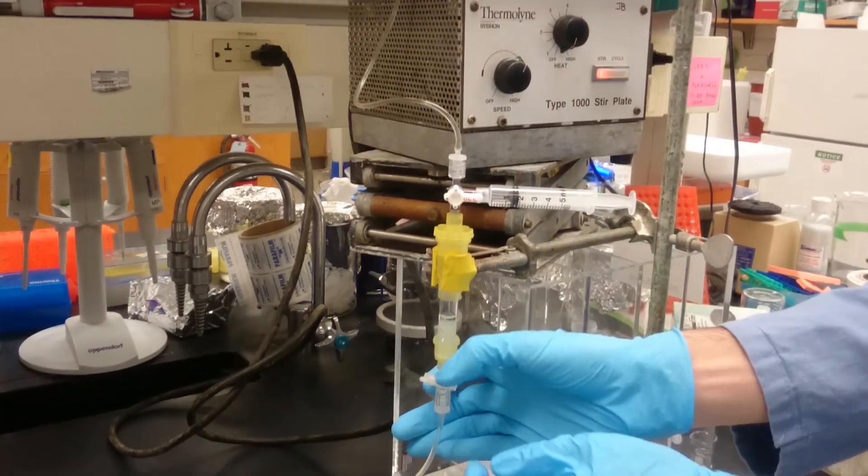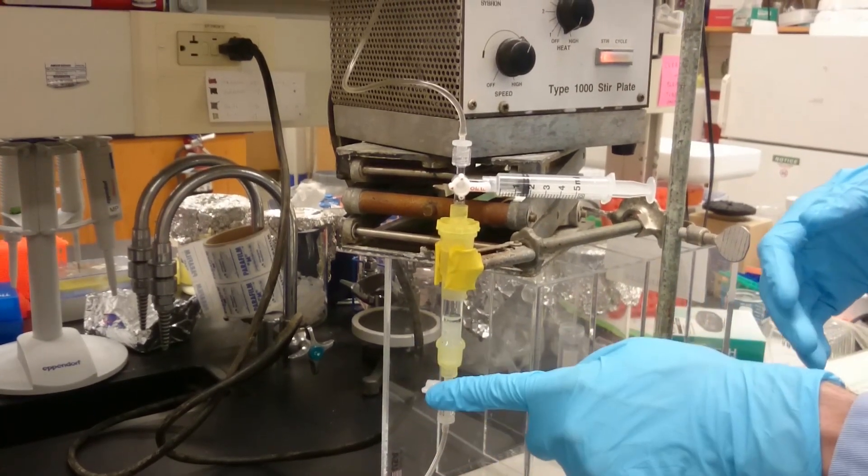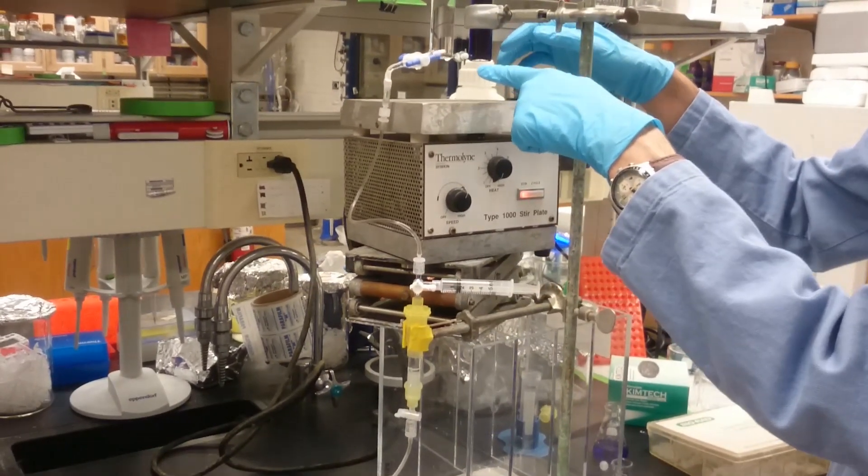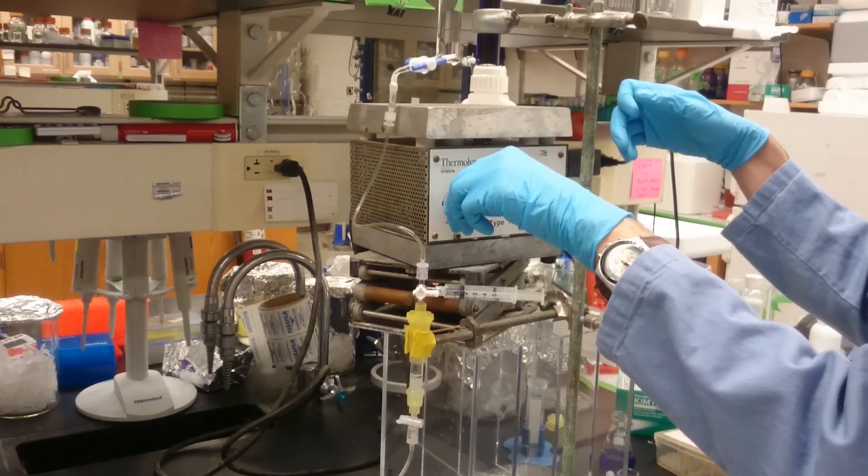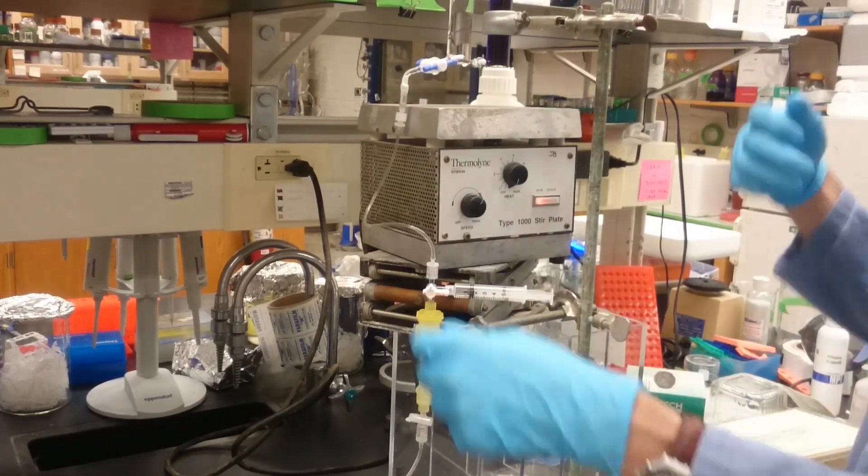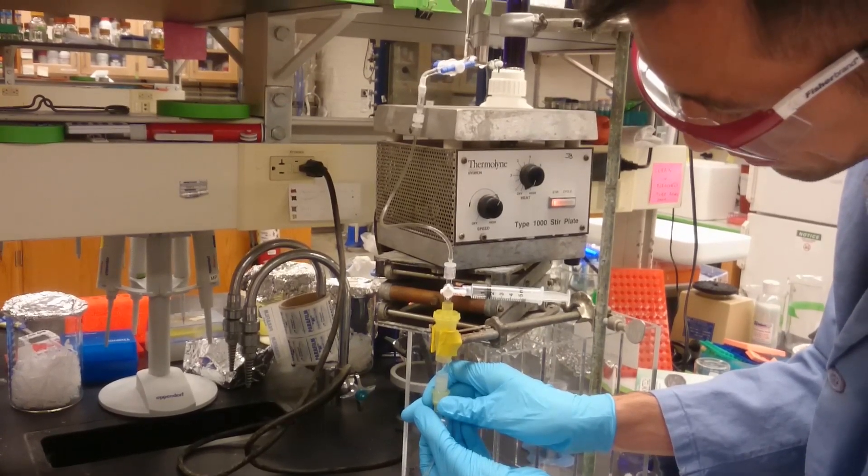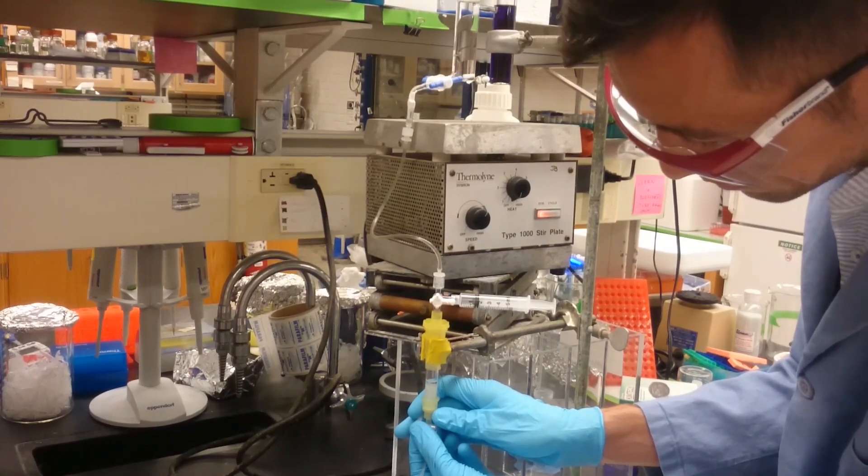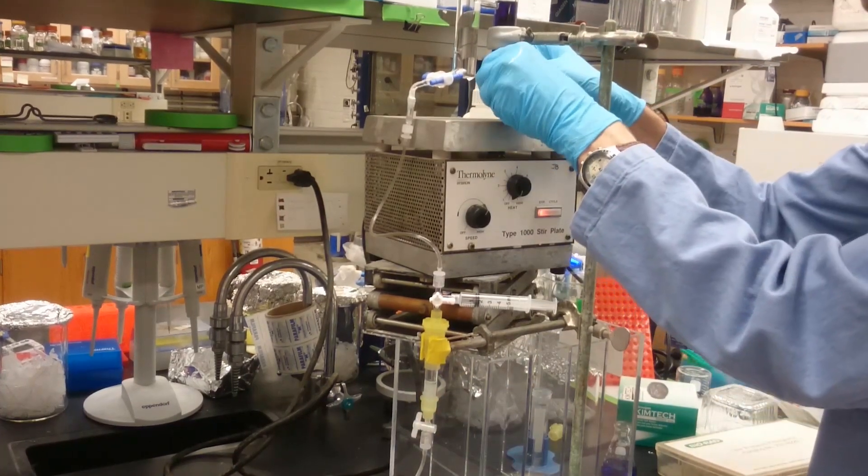And now I'm going to go ahead and open up the stopcock on the column so that the whole thing will begin to run. And when I do that, I'm going to open the small connection here between the two chambers to actually start the gradient running. Hopefully this thing will be spinning fast enough that it'll mix by the time that it runs over here. So I'm going to go ahead and open up this one, and I'm going to open this one.